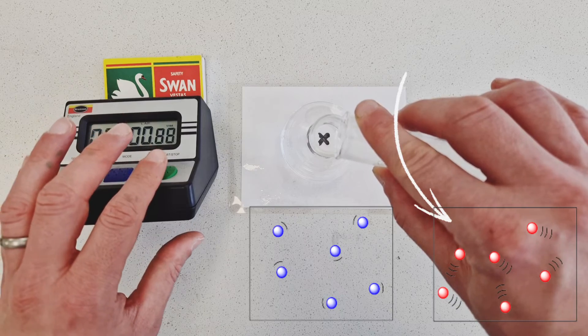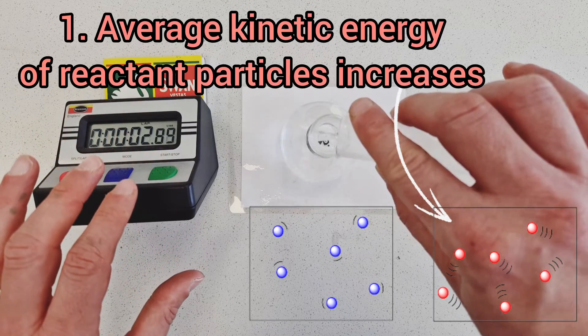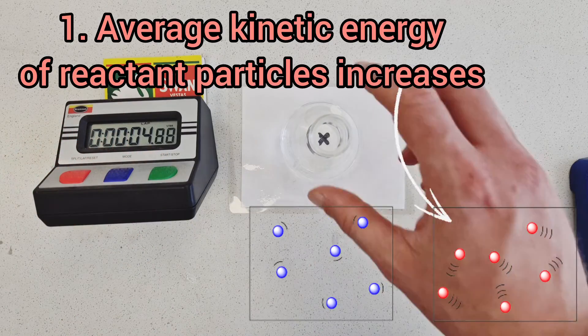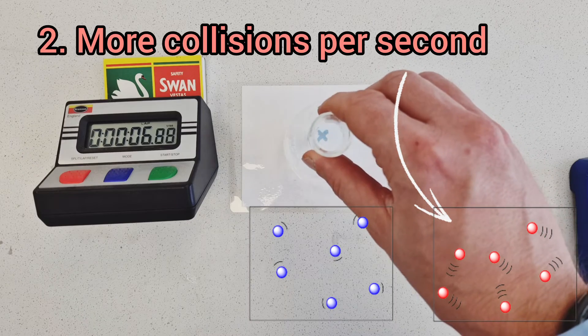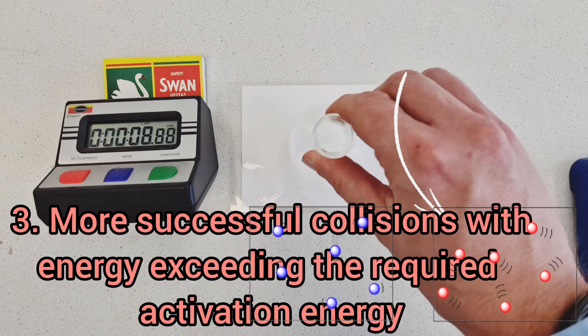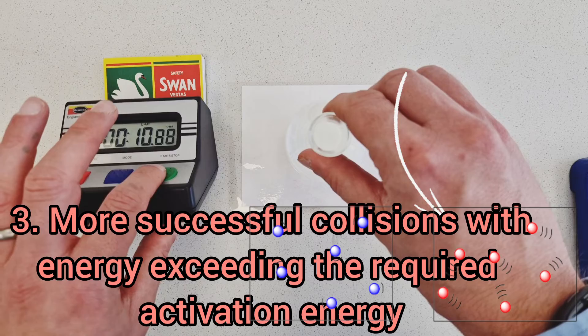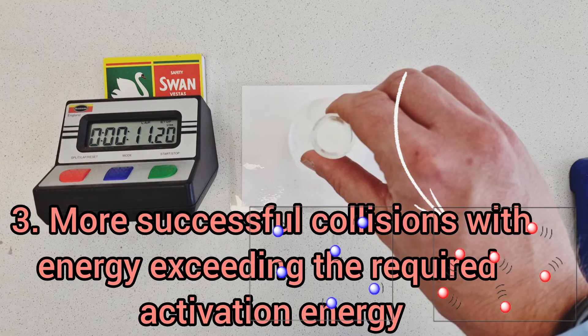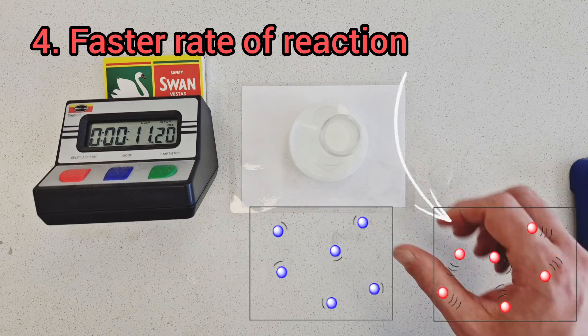So, this time we have a relatively high temperature scenario. The average kinetic energy of the particles will be higher, they're moving around faster, there'll be more collisions per second and therefore, proportionally, more successful collisions per second with energy equal to or exceeding the required activation energy resulting in a faster rate of reaction.